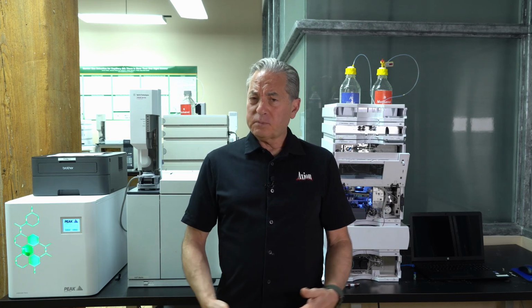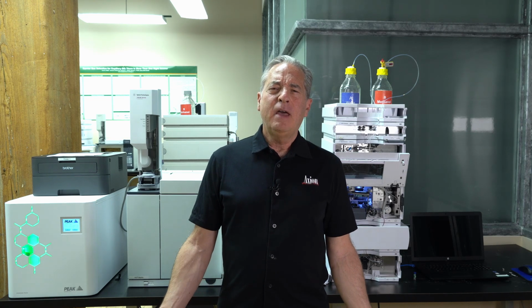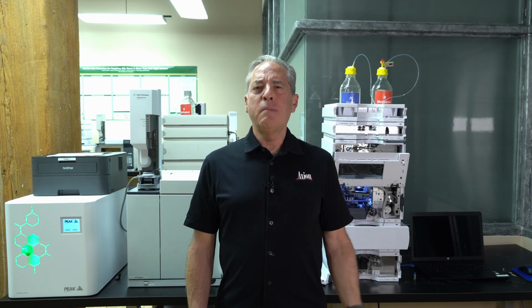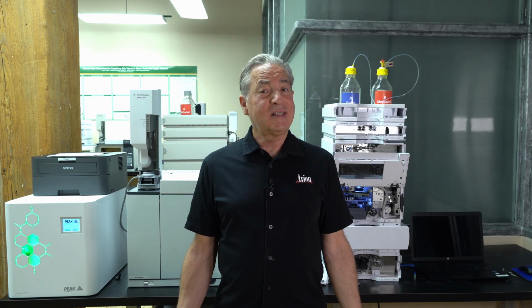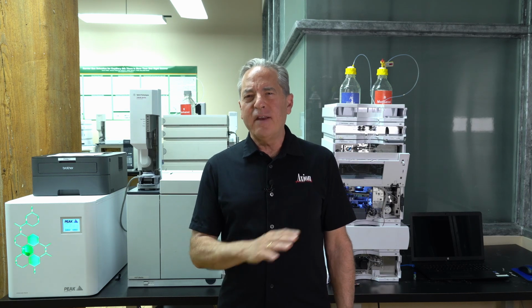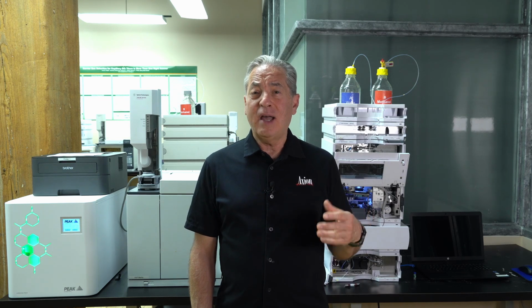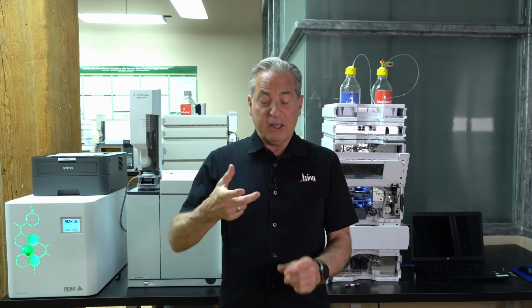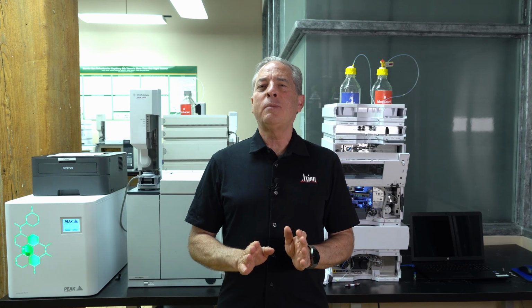In HPLC, we have a very similar rule, and that is the sample must be soluble in the mobile phase. So if my mobile phase is methanol water, I can take any sample that is soluble in methanol water and simply inject it in the HPLC. But one piece of advice, I prefer that you filter every sample in HPLC before you inject it. So whatever the sample is, I like to put it through a 0.2 micron or a 0.1 micron syringe filter, directly into the autosampler vial, and then cap the vial. By doing that, your columns will last forever.